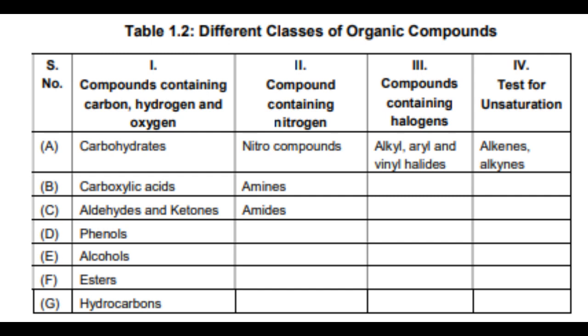These may be further designated as either reducing or non-reducing in nature, depending upon whether they reduce Fehling solution, Tollens solution, etc. or not. Simple carbohydrates are water-soluble, give a characteristic smell of burnt sugar on dry heating, give a positive ceric ammonium nitrate test, but do not give the 2,4-dinitrophenylhydrazine test. Carbohydrates give the following tests. The melting points of carbohydrates are not of much help in their identification since these generally melt over a range of temperature and often decompose on heating.